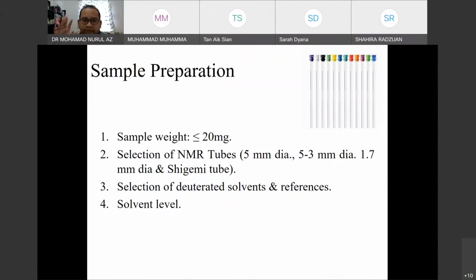They have a few parts that we will discuss here. First we will prepare the sample preparations. I will do this briefing as a kind of routine. First like a lecture, and the second one will be hands-on, like I did for Tahir, and recently yesterday for Idris, and for everybody in the previous sessions. Please make sure you are alert about this.